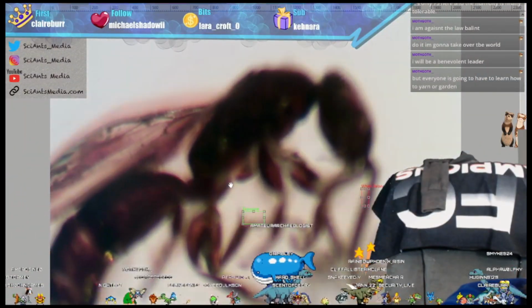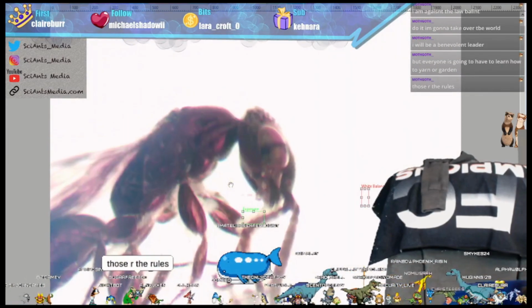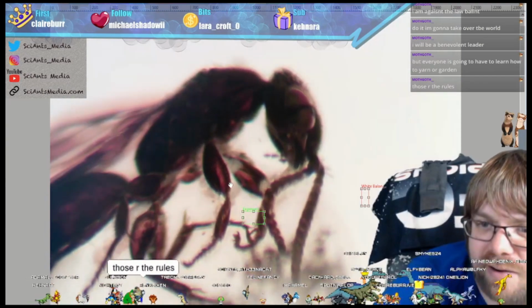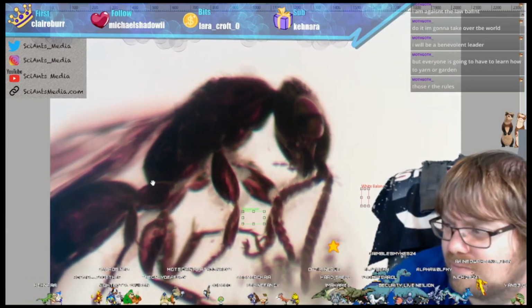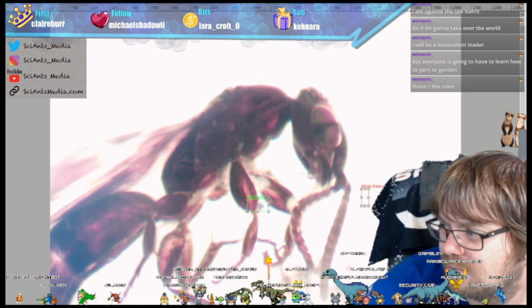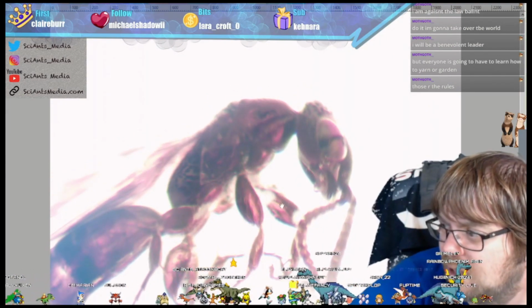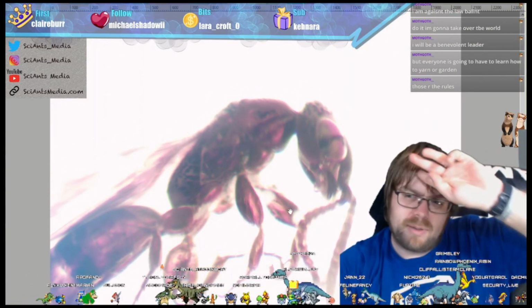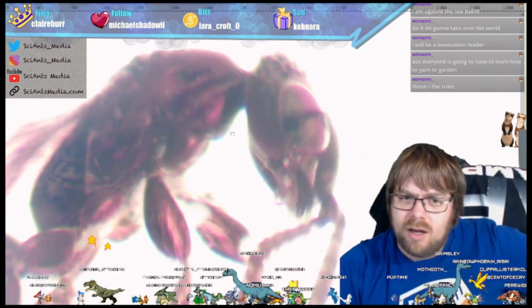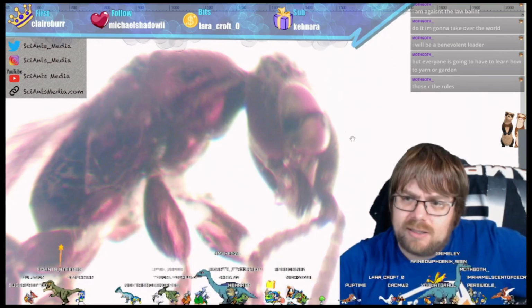A really nice look at the eye here. It's not coming through as... Oh, there we go. We're blowing out the background a little bit, meaning that it's very, very white, but we can see a lot of the structure with this much brightness.